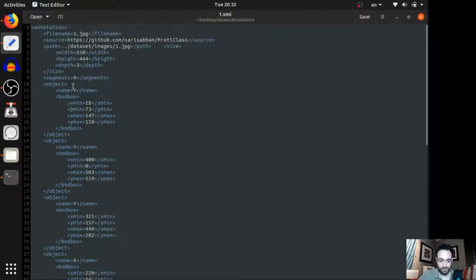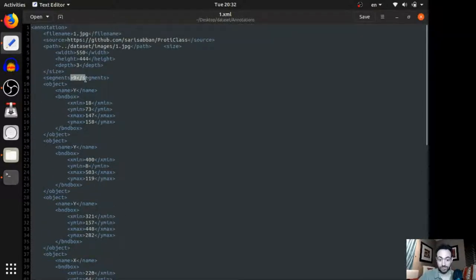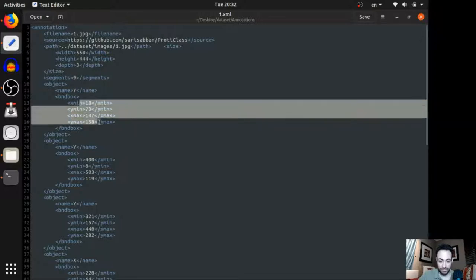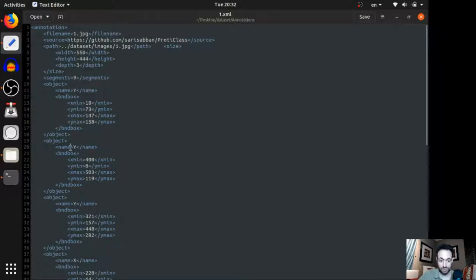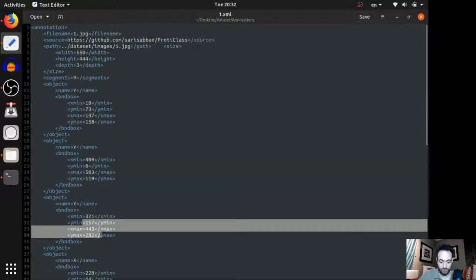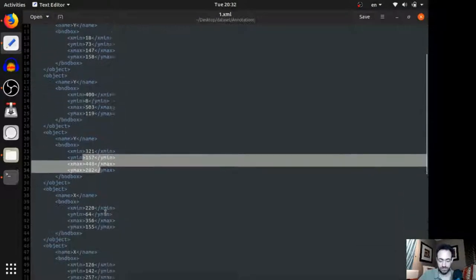Again, so you can see, I've got nine objects here. This is object Y. And this is the bounding box. Object Y. Bounding box. Object Y. Bounding box. Object X. Bounding box. And so on.